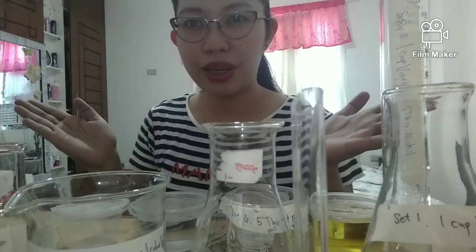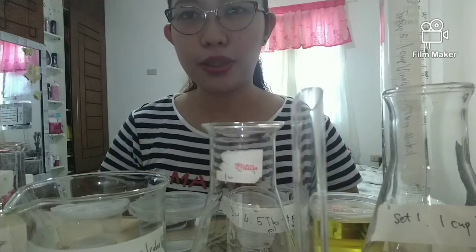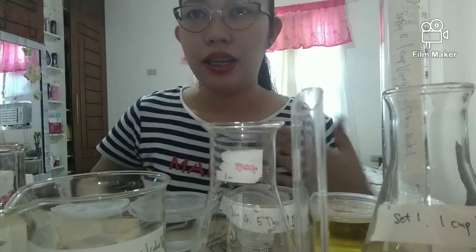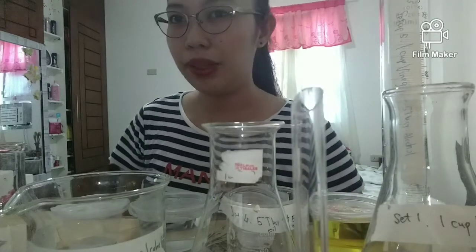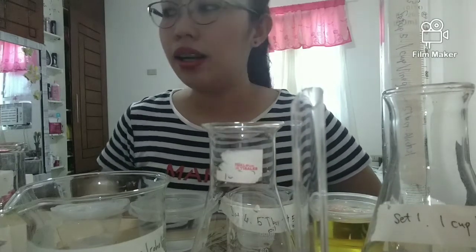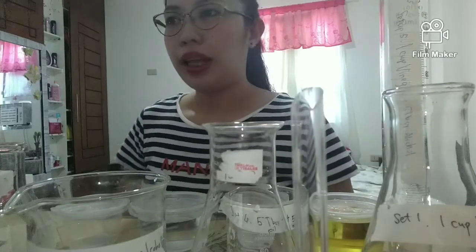Okay, so good morning everyone. In today's lesson, we have to conduct an experiment regarding polarity that is also based on your module under the What's New. In your module, we also tackled what a periodic table is, what electronegativity is, and the polarity of compounds. Now we are testing the polarity of compounds, like the mixture of different compounds such as water or vinegar.